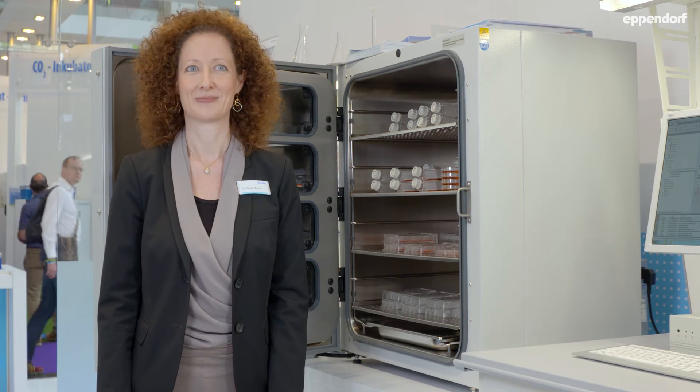My colleagues. The medium. The incubator. Well, everything is right.